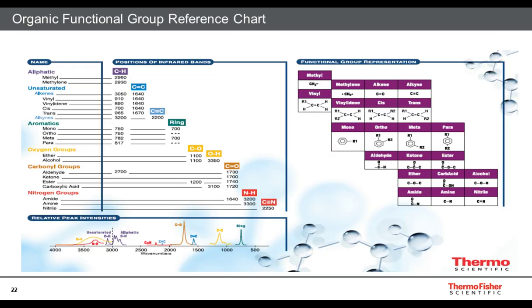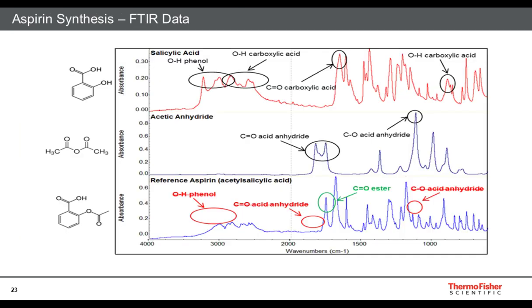And this is well known, well documented, and you'll find lots of tables online and charts. We even have a wheel that allows you to select the wavelength or reciprocal centimeter absorption, and then look at all the possible absorptions that might be associated with it to relate that to the structure.